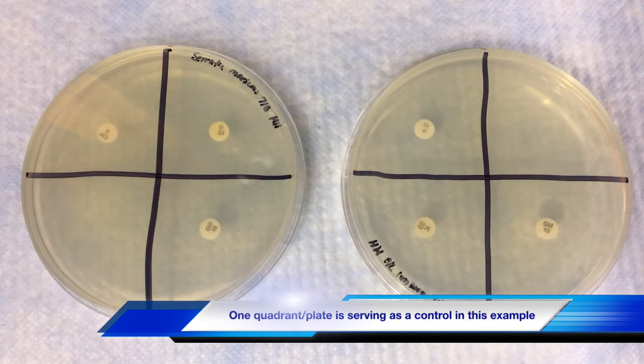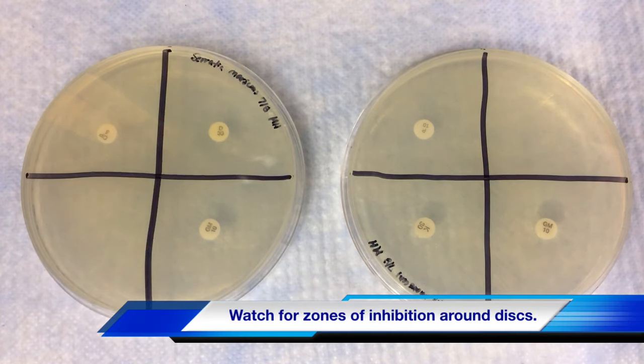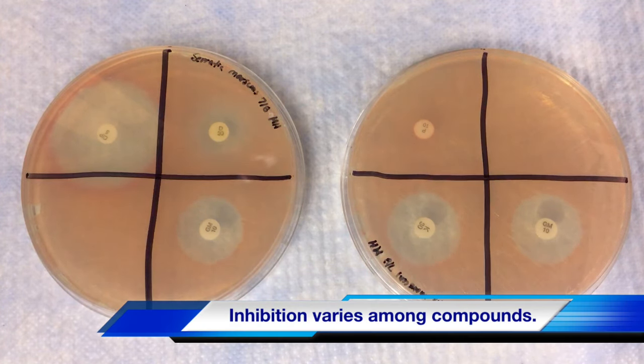Watch this time-lapse video of Serratia marcescens' sensitivity to five antimicrobial compounds. Notice the zones of inhibition around each disc. The diameter of the inhibition zone is a measure of sensitivity to a compound, with greater sensitivity forming larger zones and lower sensitivity forming smaller zones.